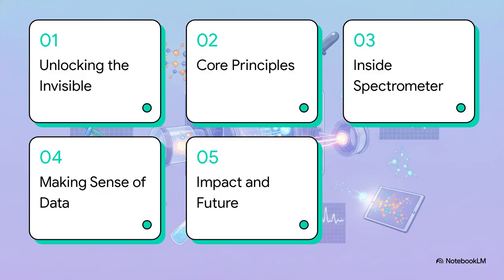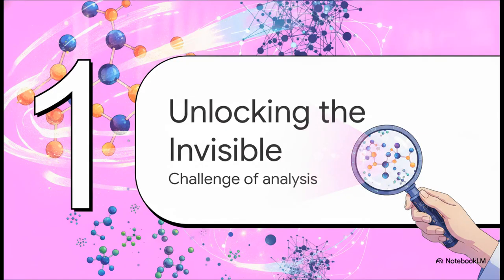Here's the roadmap for our sample's journey today. First, unlocking the invisible. Second, the core principles. Third, inside the mass spectrometer. Fourth, making sense of data. And finally, real-world impact in the future. Let's get into it.